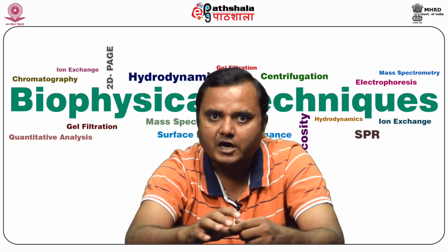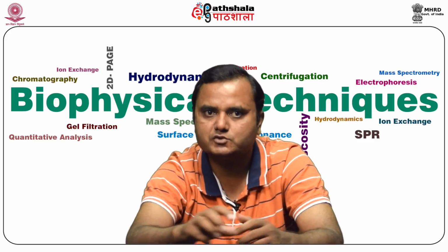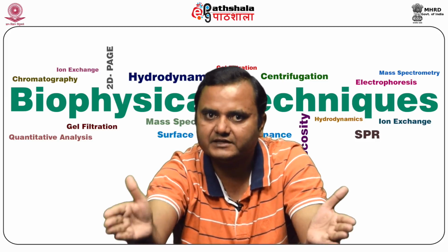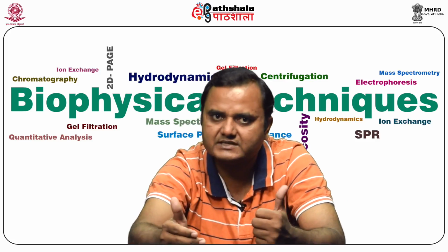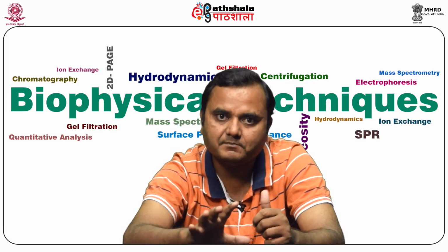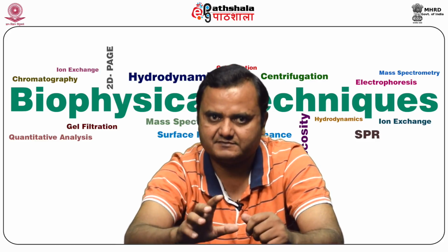and less heavy or less dense particles settle later. However, in many cases, differential centrifugation is used to separate intracellular matter, and thus this method is also called the subcellular fractionation method, because all the cell organelles have different density, mass or size. Once you go through the centrifugation process, these particles are separated out at different speeds and can be separated one by one. During subcellular fractionation, various markers can be used as quality control to give an assessment of the quality of separation of individual fractions.